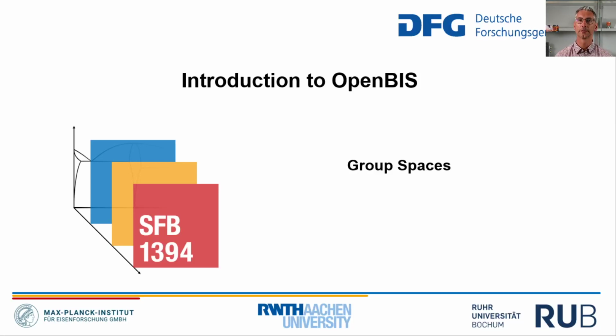Hello and welcome back. In this session we focus on group spaces in our OpenBIS training for the CSE.